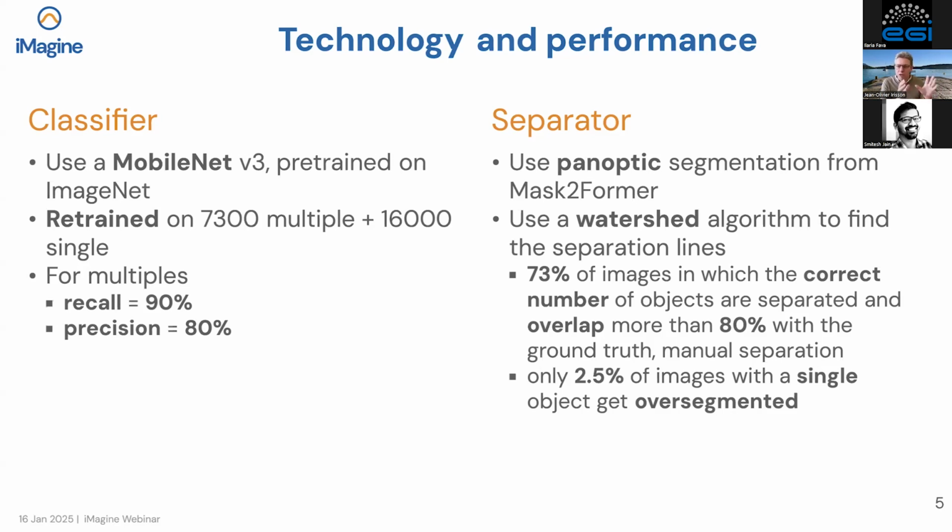So we use those deep masks to identify the object, and then we use something that's called a watershed algorithm. So we just grow a region as the water would flow on a topography, let's say, to really match the objects to the pixel, so that it's really completely compatible with what was done before.